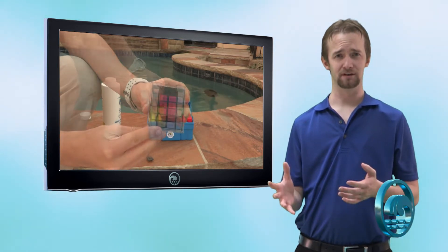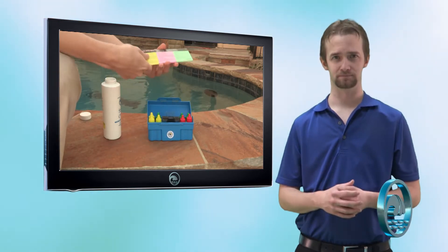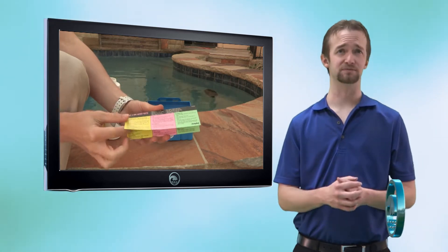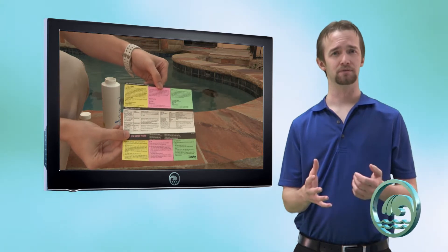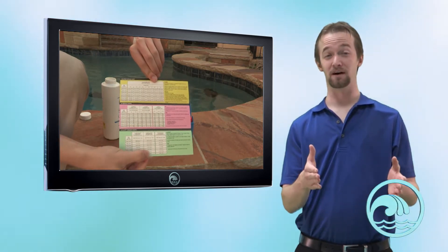I'm going to show you how to use this kit in an interactive way so that you have some confidence when you go on to test your water for the first time. The first thing we're going to test for is chlorine. Chlorine is the yellow bottles — they're labeled different numbers, and the instructions for testing the chlorine are in the yellow box inside of the lid.